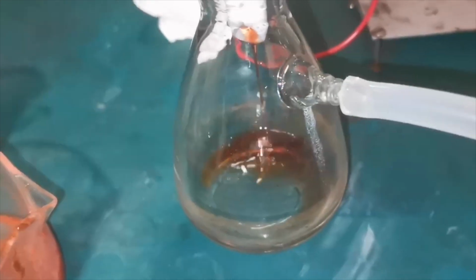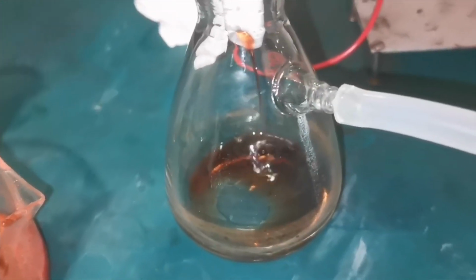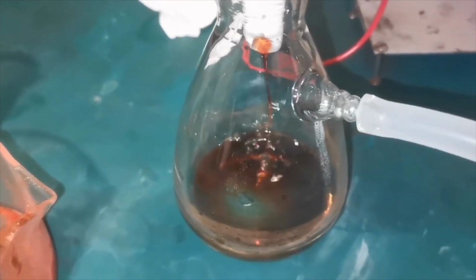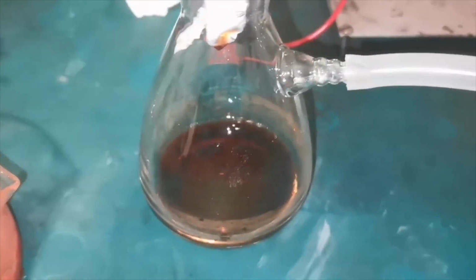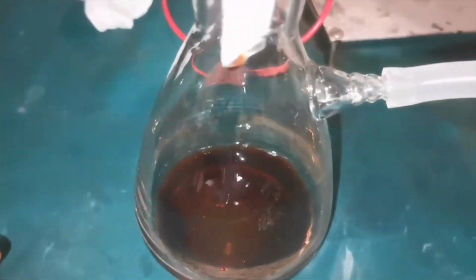In conclusion, this project of extracting cobalt from samarium-cobalt magnets worked to some extent. It wasn't a perfect success because I designed the procedure somewhat badly and many unexpected things happened, but the project really improved my understanding of the general procedures of metallurgy and metal extraction.